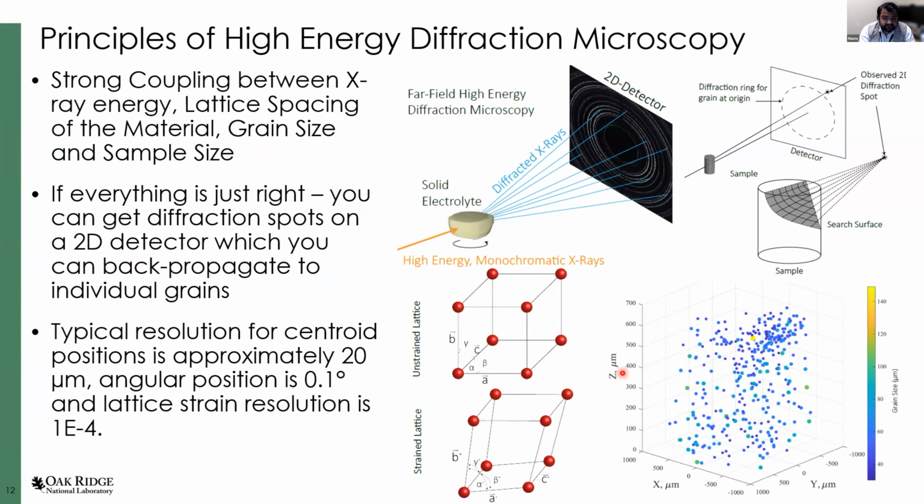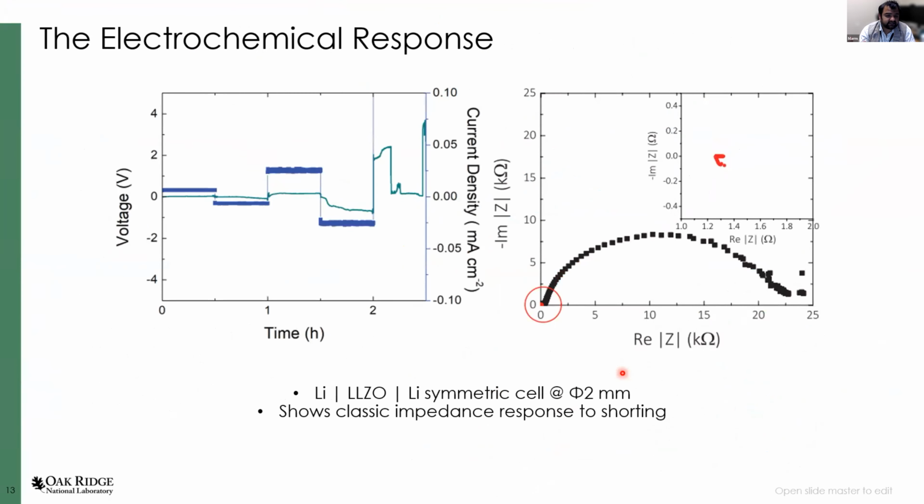What we did was replicate the lab experiments that we do in charging and discharging a battery at the beamline in situ, where we see a very consistent behavior: flat polarization profiles initially, and then these wonky profiles that say we have shorted our electrolyte. We also see this with electrochemical impedance spectroscopy, one more measure that electrochemically shows we have shorted the cell.